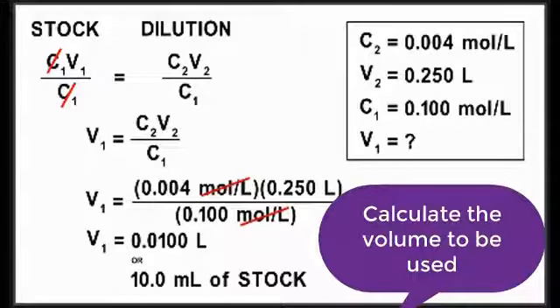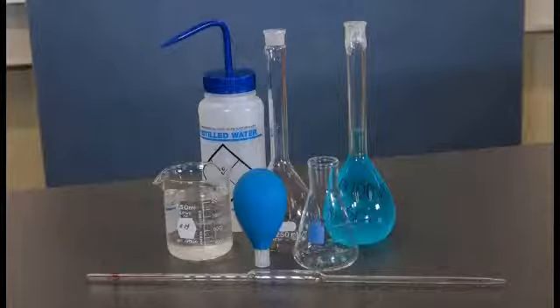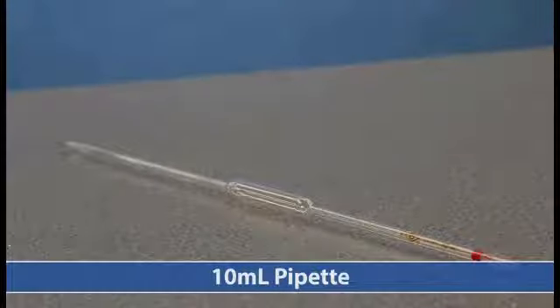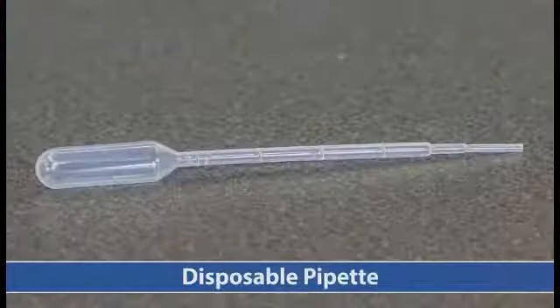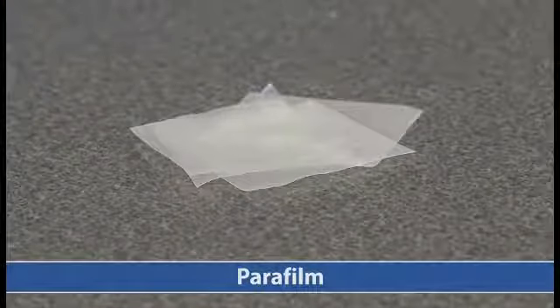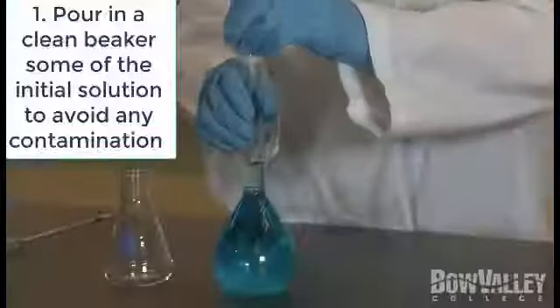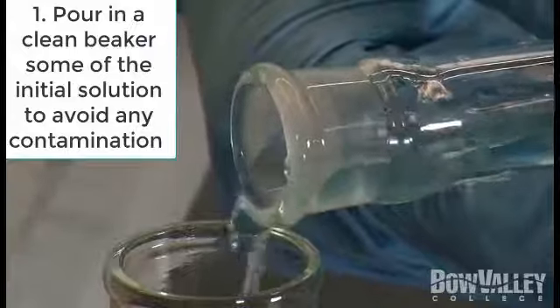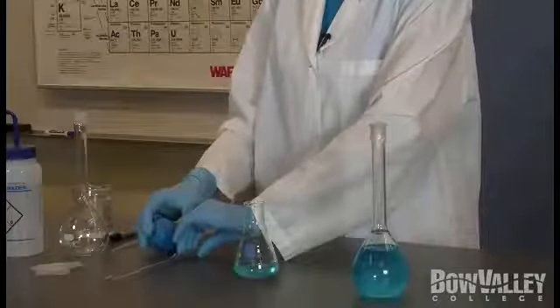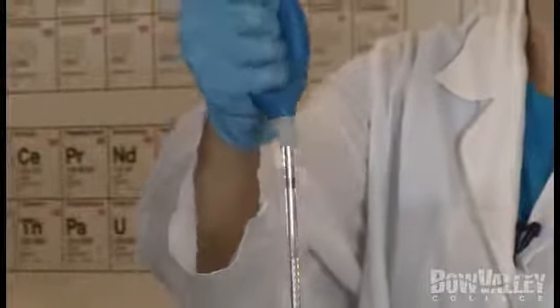We will first need to determine the amount of stock solution required. To prepare the dilution, we will need the following materials: stock solution, a 10 ml pipette, pipette bulb, Erlenmeyer flask, distilled water, disposable pipette, parafilm, and a volumetric flask. Since we do not want to contaminate the stock solution by directly inserting our pipette, a small amount is first transferred to an Erlenmeyer flask.